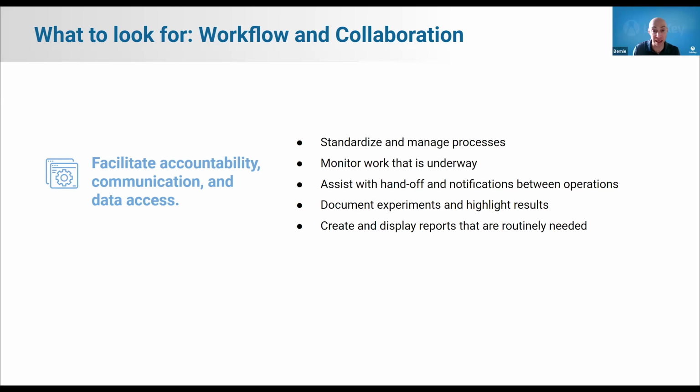And therefore, many LIMS will offer either ELN functionality or other annotation functionality that will help explain happenings in the system and highlight important information. And as I mentioned in the last slide about data management, it's often for others that we generate analyses and reports, not just for ourselves.